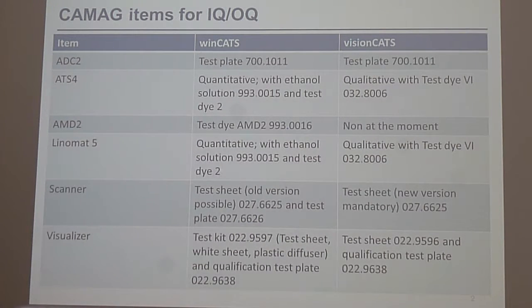First, you see these colors here. They are not for you, they are internal for us, because we always had a special one for us internally and one for you externally, and I thought, okay, come on, we do one. And with these two here, if you see, they look a little unsharp. This is exactly a Gauss peak. Therefore we wanted to get rid of the scanner test plate.